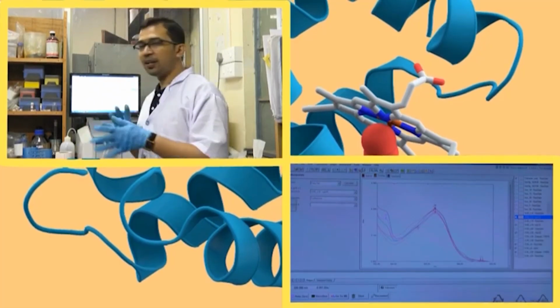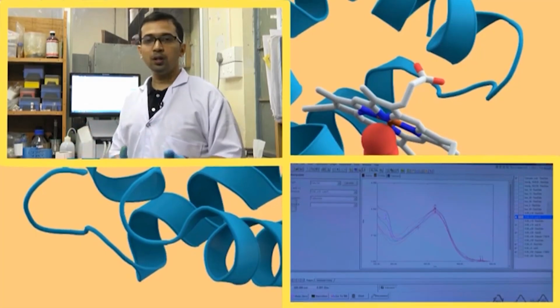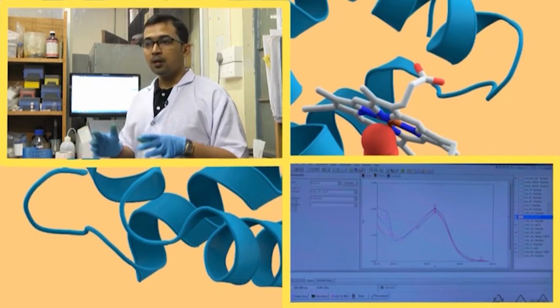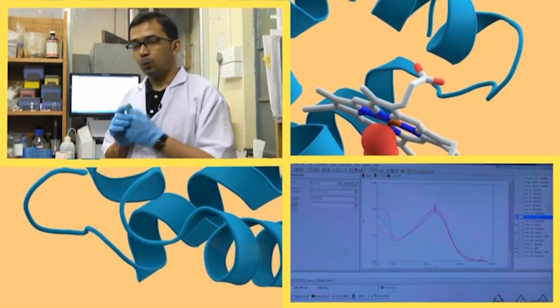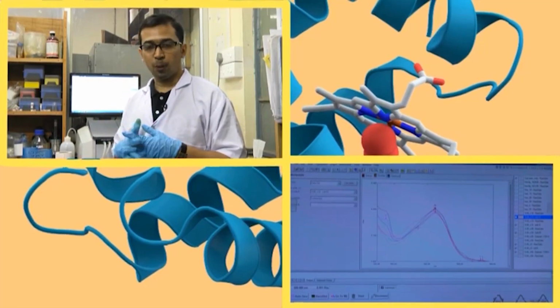However, from here we can't quantify the extent of interaction unless we plot the equations and get the Ka values. Okay. Now, why are you getting this uneven distribution? Number one, there might be a manual error. Okay, that is a very easy problem to address.